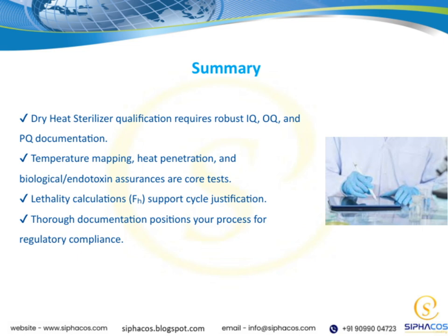Lethality calculations, specifically FH values, are also vital. They support the justification of cycle parameters by quantifying the sterilization effectiveness. Finally, thorough documentation of all these aspects positions your process well for regulatory compliance. It provides the necessary record to demonstrate that your sterilization process is reliable, consistent, and compliant with industry standards. Together, these points highlight how comprehensive validation and documentation underpin a successful sterilization process, ensuring safety and compliance across the board.